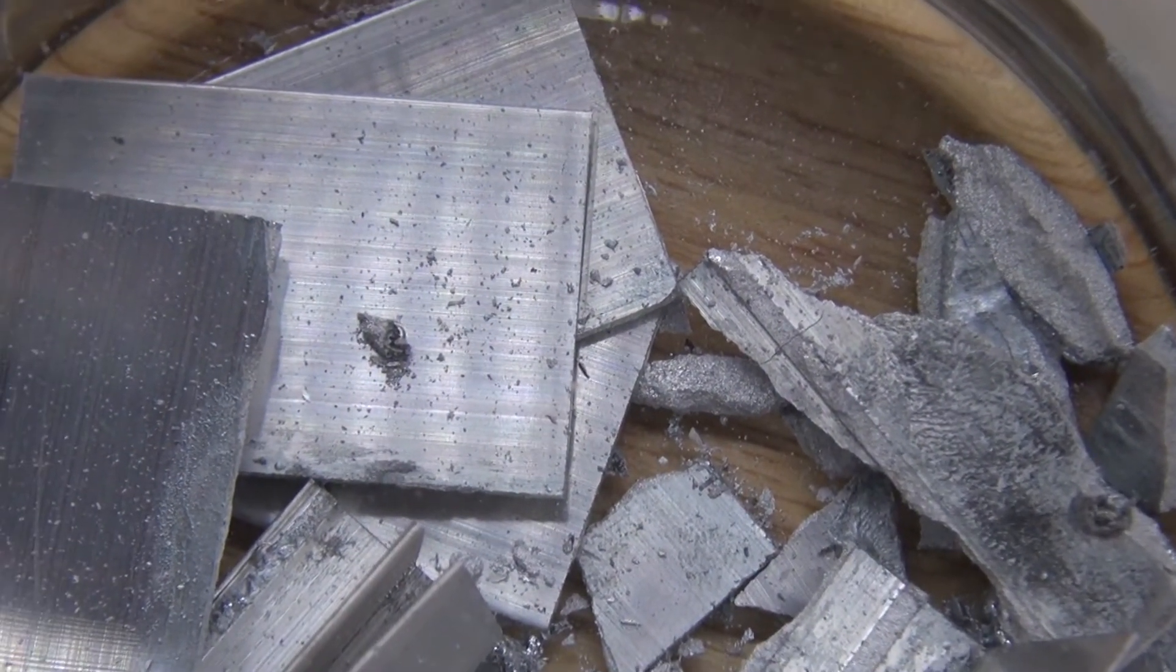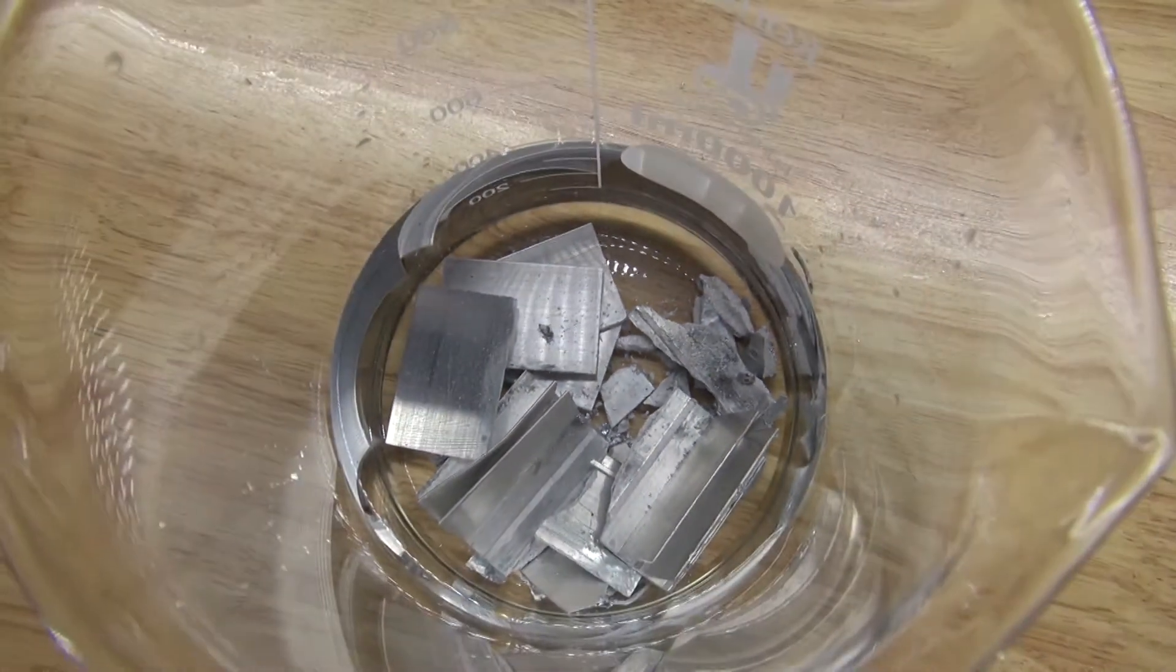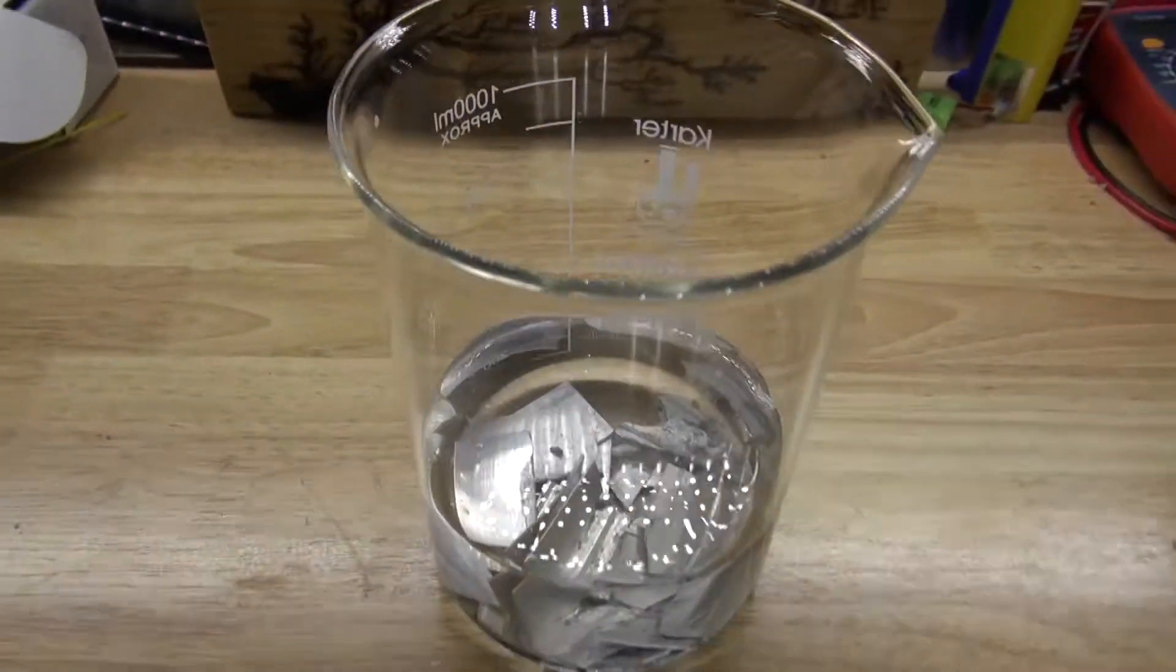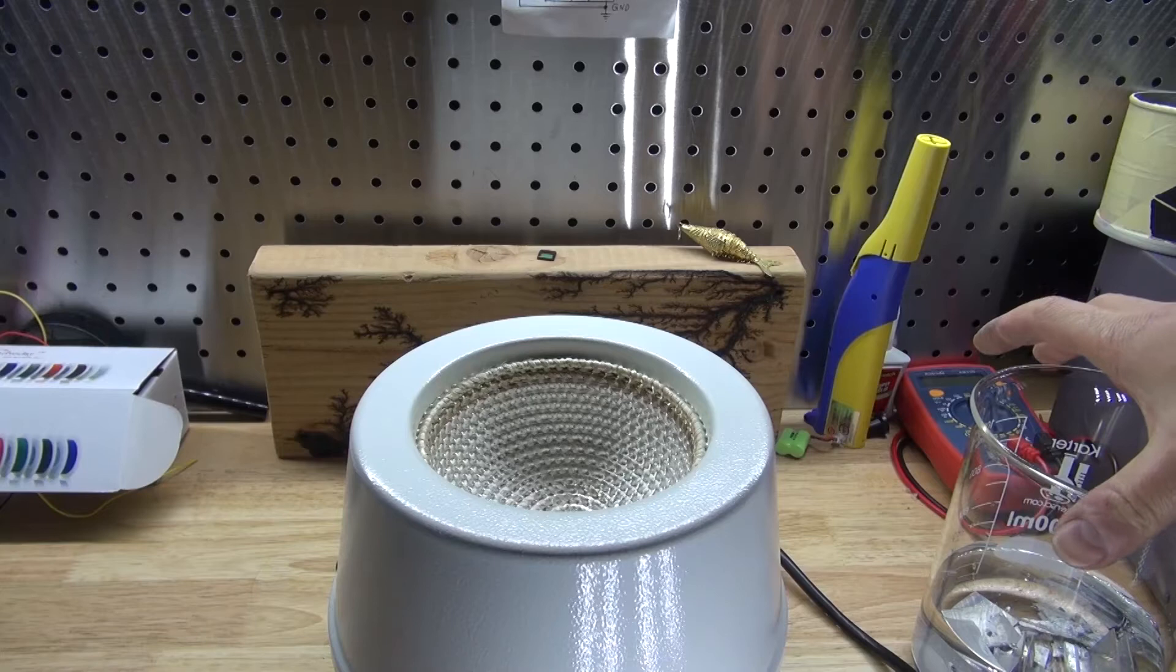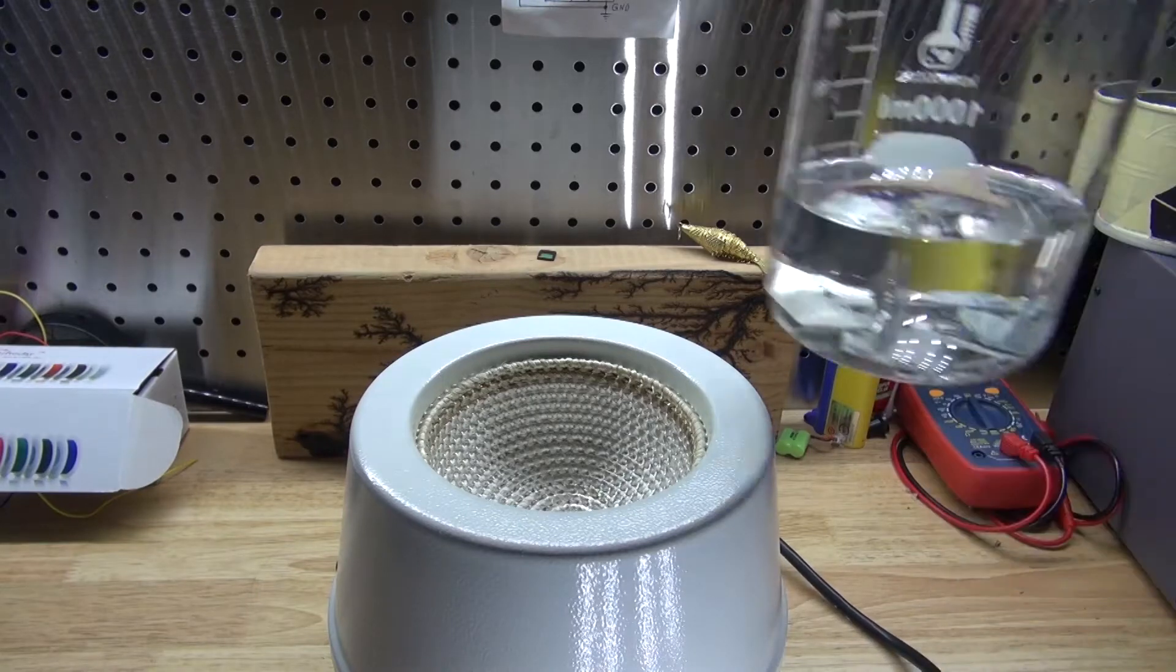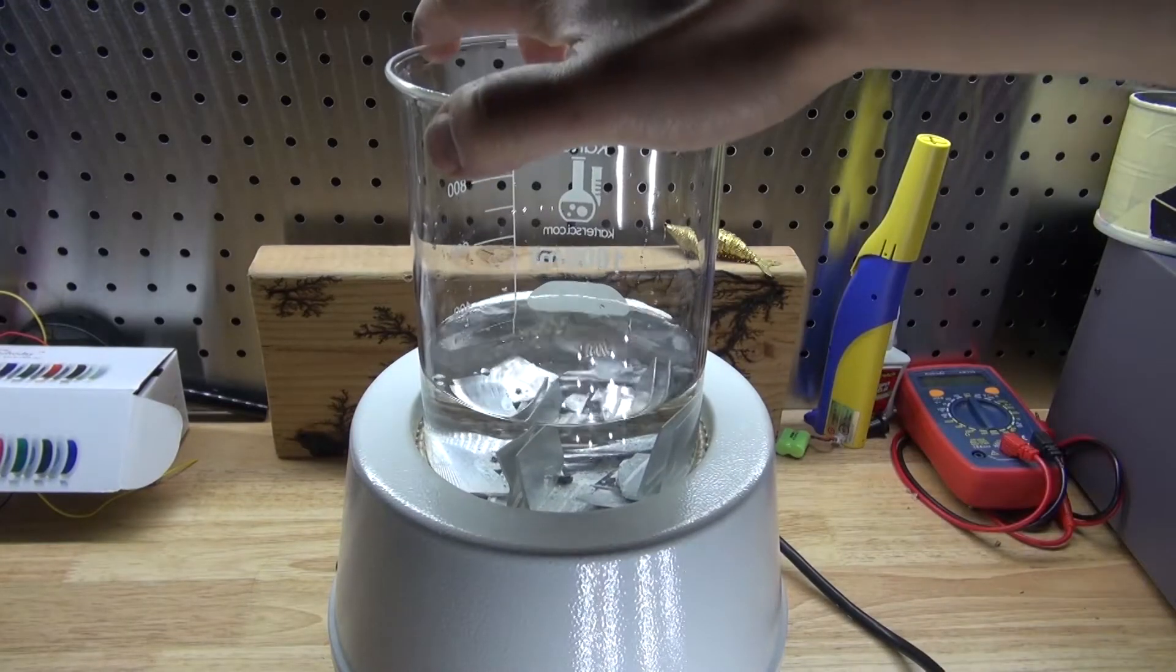But that reaction, by just leaving it at room temperature, is a little bit too slow, and especially since my room is too cold. So what I'm going to do is take the beaker and put it inside of this heating mantle to speed up the reaction even more.